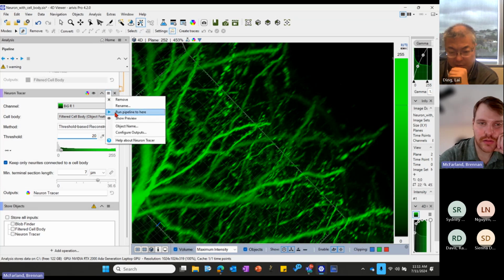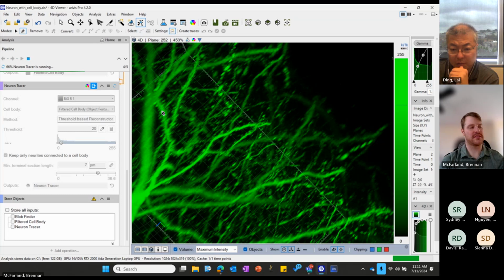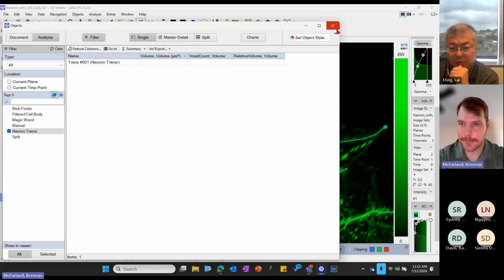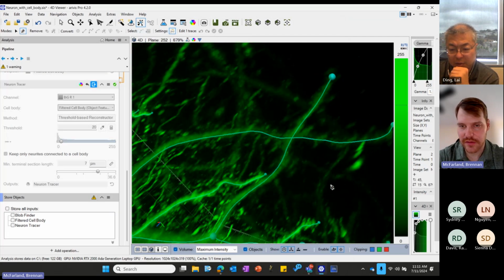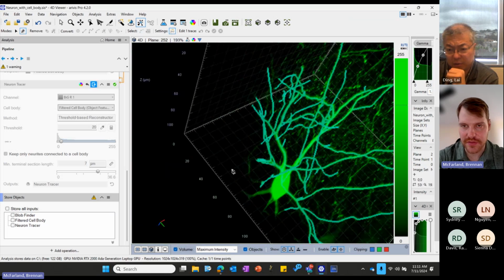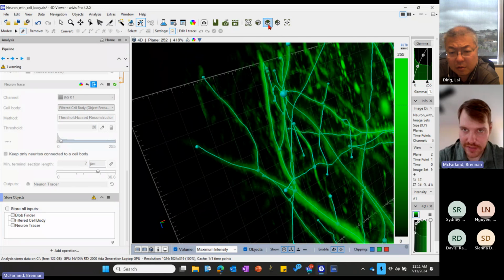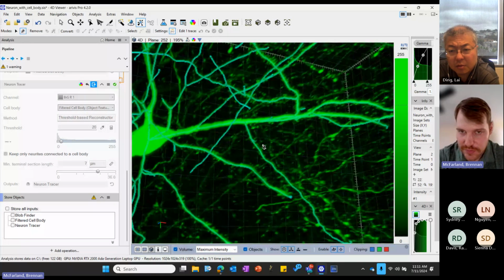We'll cut off that background. Let's see how that looks. I'm hoping that'll fill it in. But if you are using it to fill in some of those lower intensity regions, you can also run the risk of, yeah, got it, connecting some of those other, no, okay, got it there. Like other spots that we maybe don't want. It's kind of getting it actually now. Look at it. It doesn't look like there are any large areas that it's really messing up.